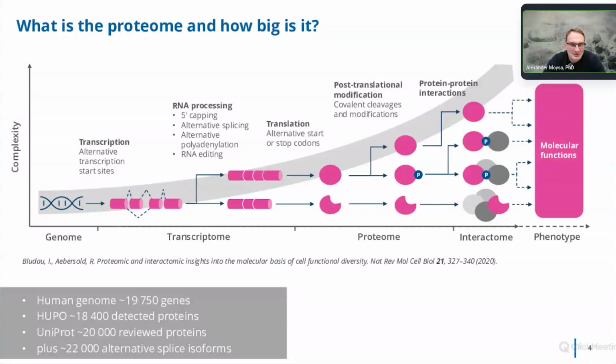In today's presentation, my aim is to provide some background about proteomics. What is proteomics? How do we do it? Why do we do it? I aim to give some understanding of how proteomic studies may accelerate drug discovery and drug development processes. While I won't go into deep technical details, I would like to give you some understanding of how mass spectrometry works, because it's important for understanding what kind of data can be obtained in the experiment.